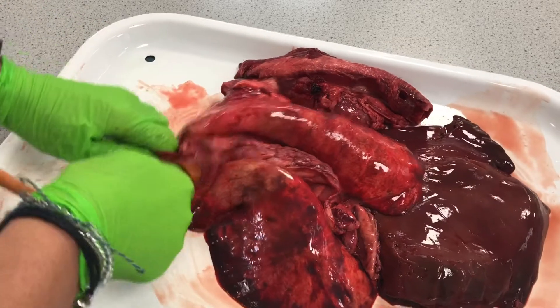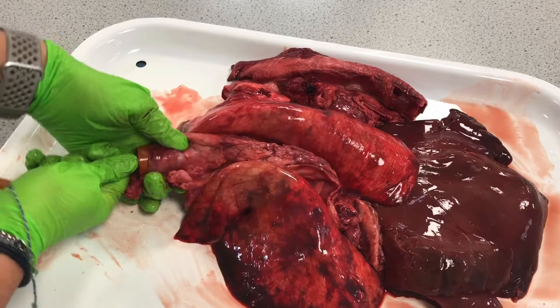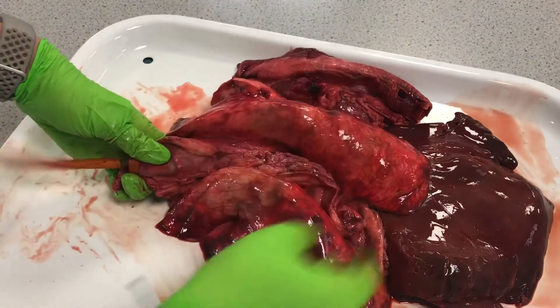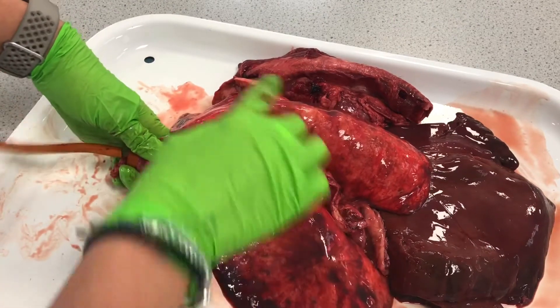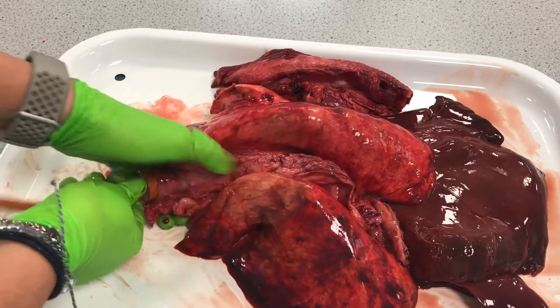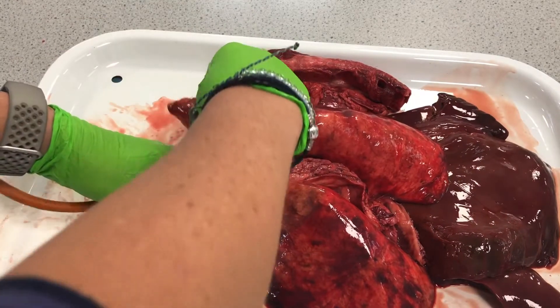Sounds like we've got an air leak somewhere — let's get that right down in there. This lung here is starting to inflate. Unfortunately, we've got some gaps in the lung, I think, that's not enabling us to get full inflation.